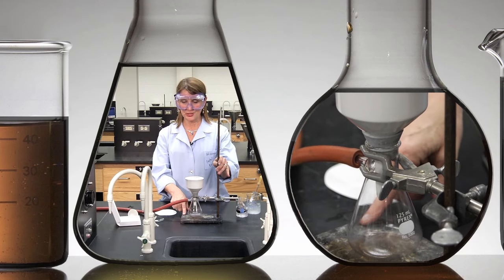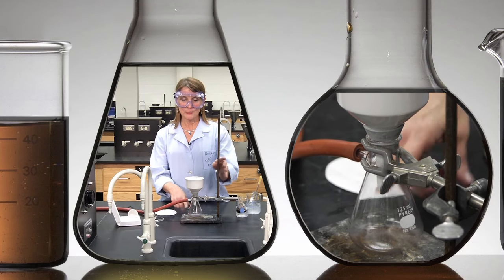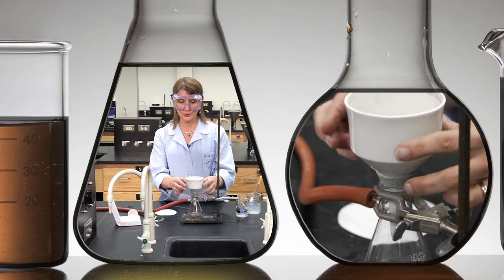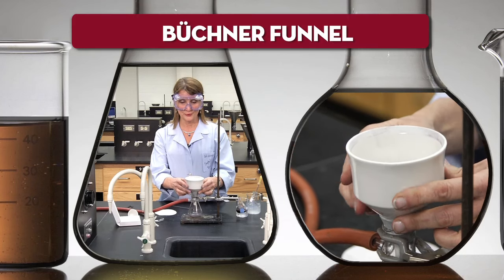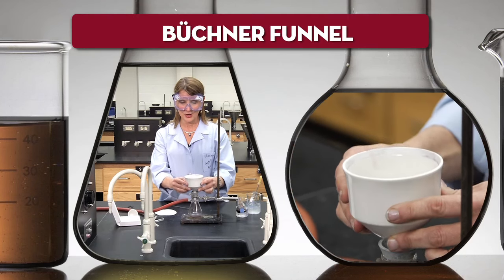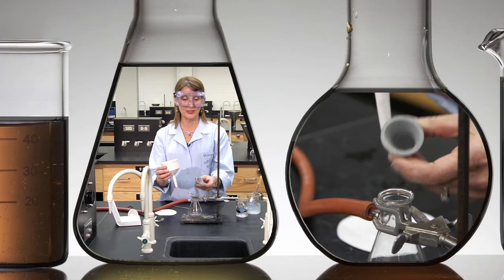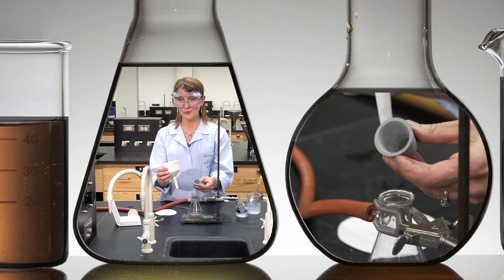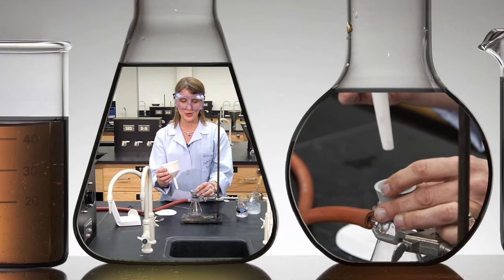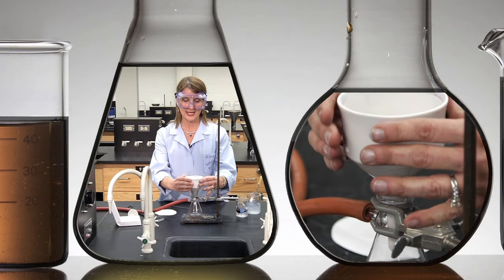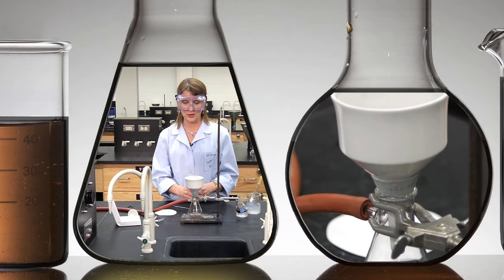This is a vacuum filtration apparatus. You start with choosing the correct size filter flask. This is a Buchner funnel, attached to a filter flask on top of a neoprene adapter. It's very important to have the neoprene adapter there so that there is a tight seal when a vacuum is formed.